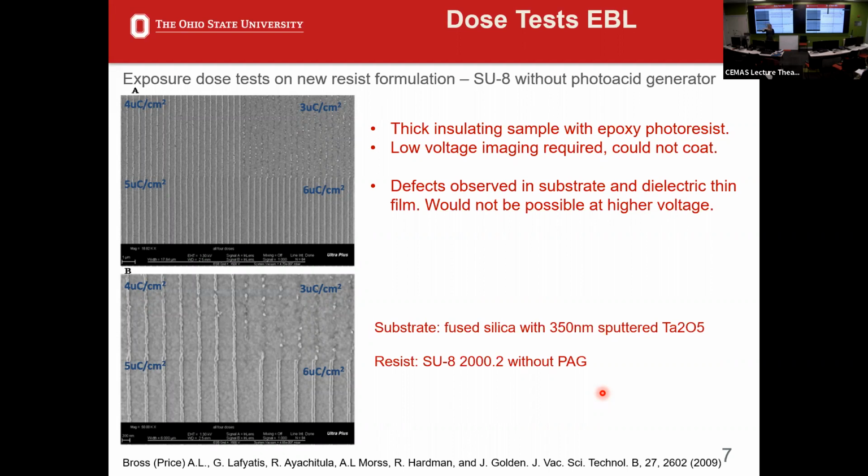And the cool thing is that if you're looking at an image like this, where the lines are bright and the background is darker, the contrast actually flips right after you reach that neutral point.